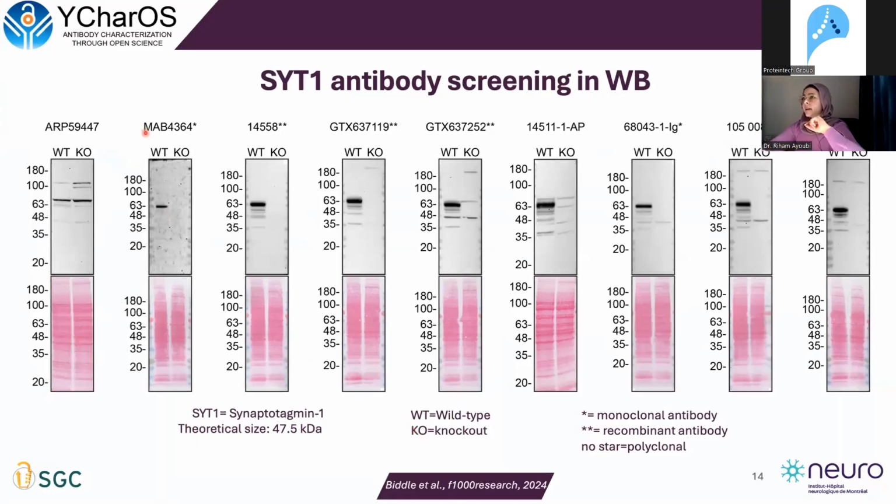Antibody catalog numbers are shown at the top of each corresponding blot and presented in alphabetical order. The chemiluminescent signal is shown at the top with each corresponding Ponceau staining, which is presented as a loading and quality control.